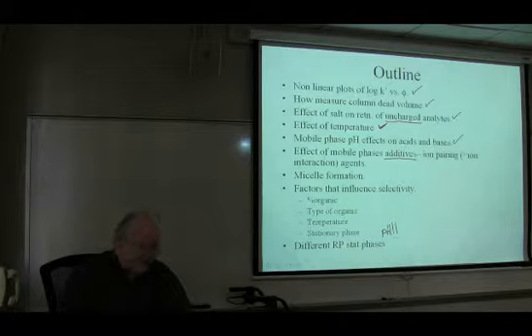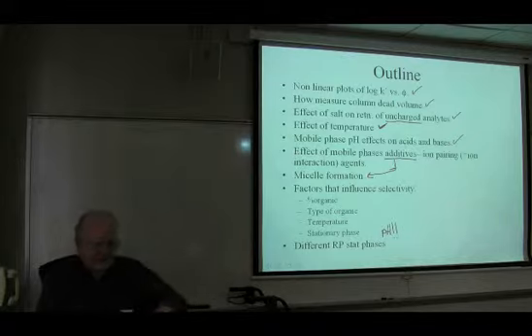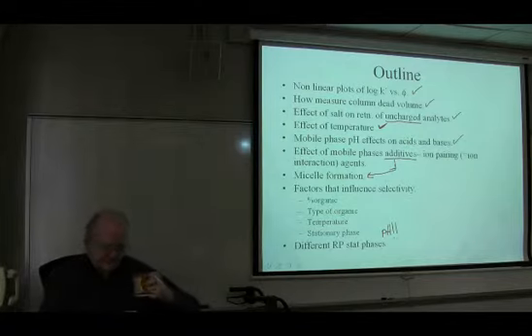One of the things related to certain kinds of additives is what happens if you exceed what we call the critical micelle concentration. If you actually form micelles, and I'll show you what they look like in the mobile phase, that can have a tremendous impact on what you see in terms of retention.